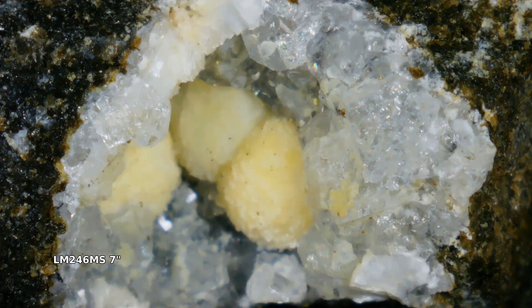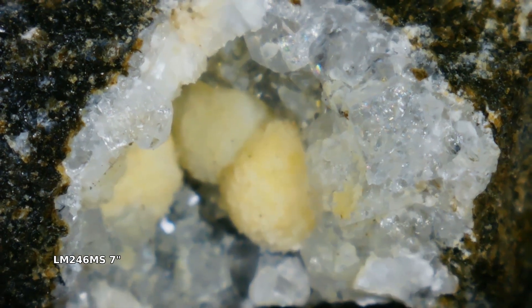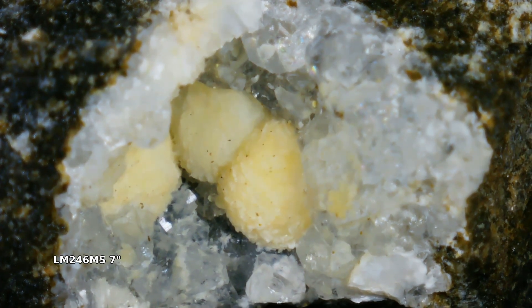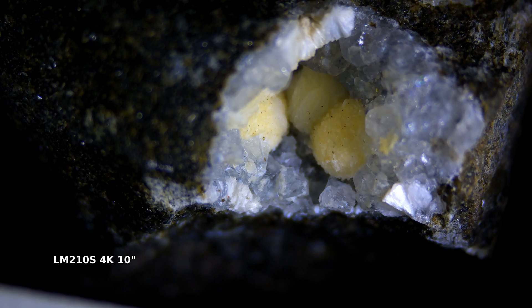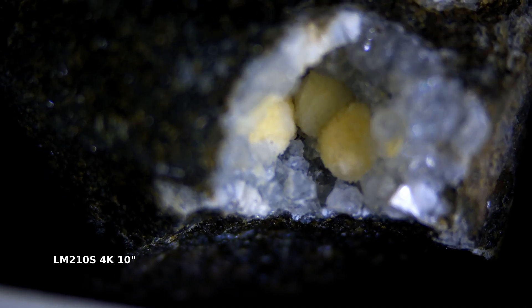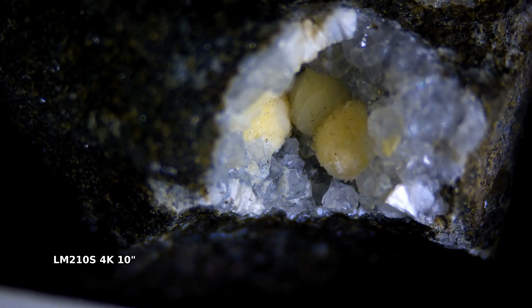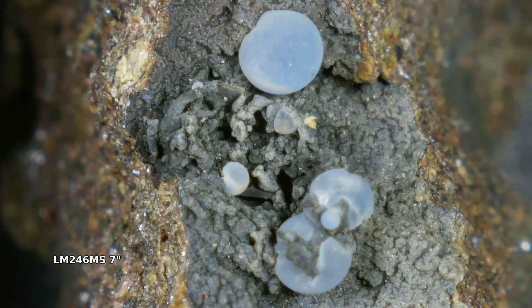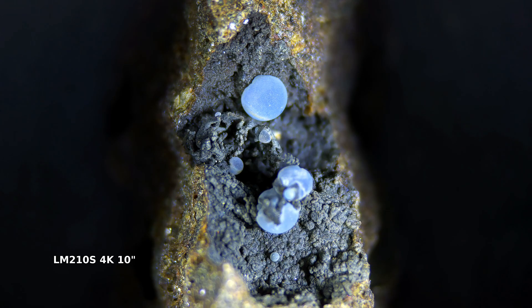Here's some Gyrolite — those little creamy balls right there in the middle of your screen. Moving on into 4K. I didn't exactly line this up, but you can see the structure in both of these. Now, to a little bit of an easier test: we have some Thompsonite. Being that it is very opaque on a black background, it looks really good under both of these digital microscopes. The colors are a little more true-to-eye on the 4K, which is a huge benefit — just to be able to optically see it properly.